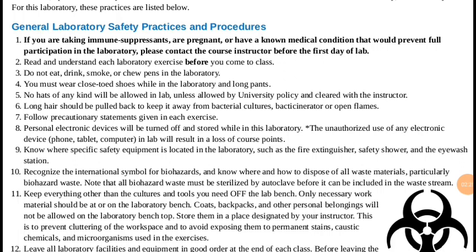Before we continue, let's take note that if you are taking immune suppressants, you could be pregnant, or you could have a medical condition that can compromise your immunity or will prevent full participation in the lab, you need to contact the course instructor before the first day of the lab.